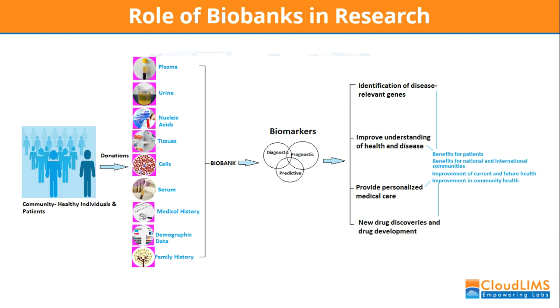Having a closer look at what the role of the biobanks is in research, samples alongside clinical data facilitate identification of prognostic, diagnostic, and predictive biomarkers.